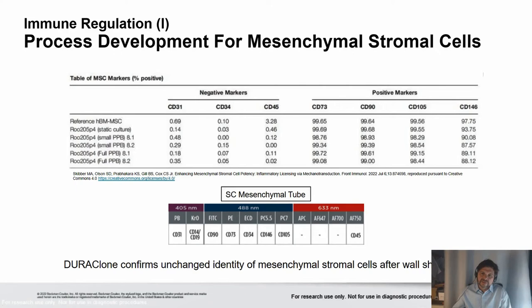So we can also use this basically in a completely artificial scenario in situ, just as we would be able to use this tool to, for instance, characterize extracts from a stromal vascular fraction.